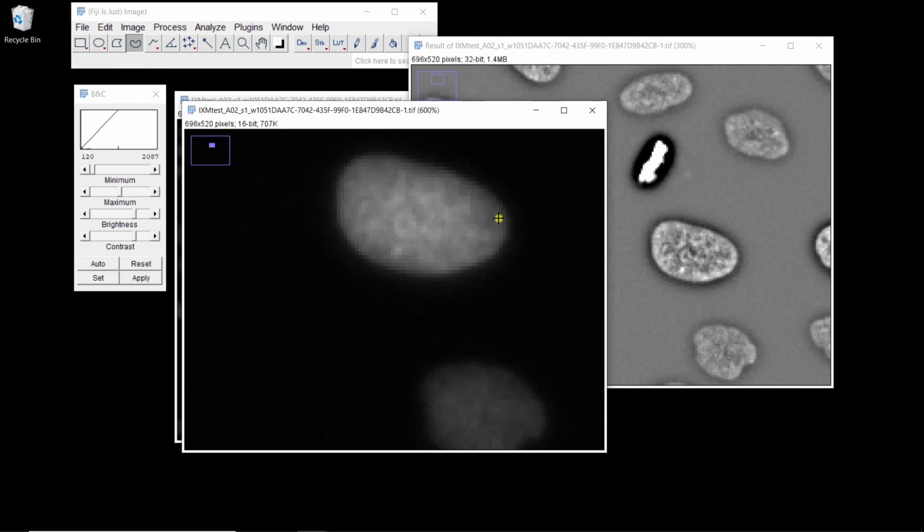When you blur it, it's going to be something that is average. So where you have local maxima like this, it's a bit higher intensity than the pixels that are around. When you blur everything, it's going to be a lower value, so then your local maximum is going to appear even more. And when you have lower intensity, same thing.